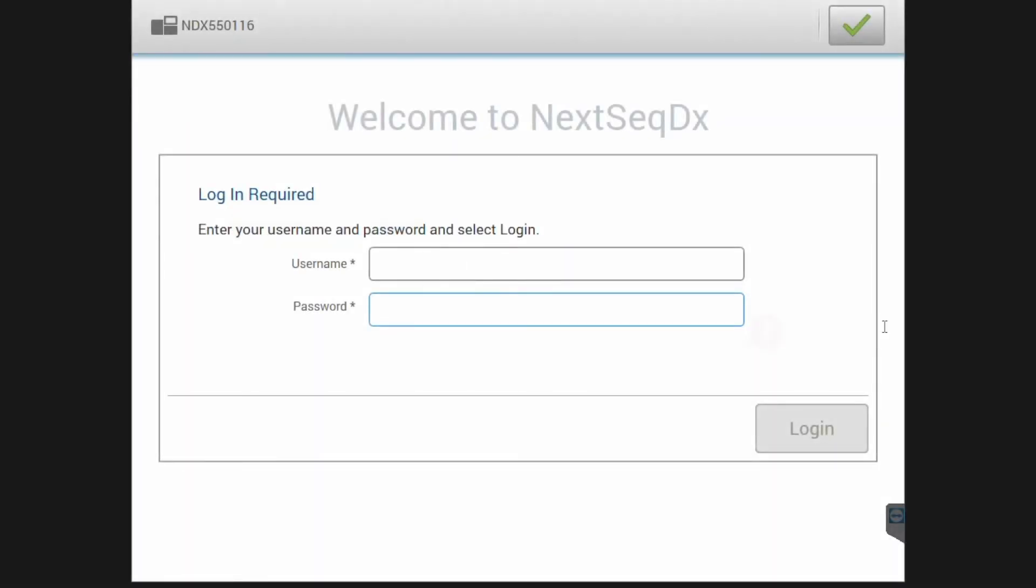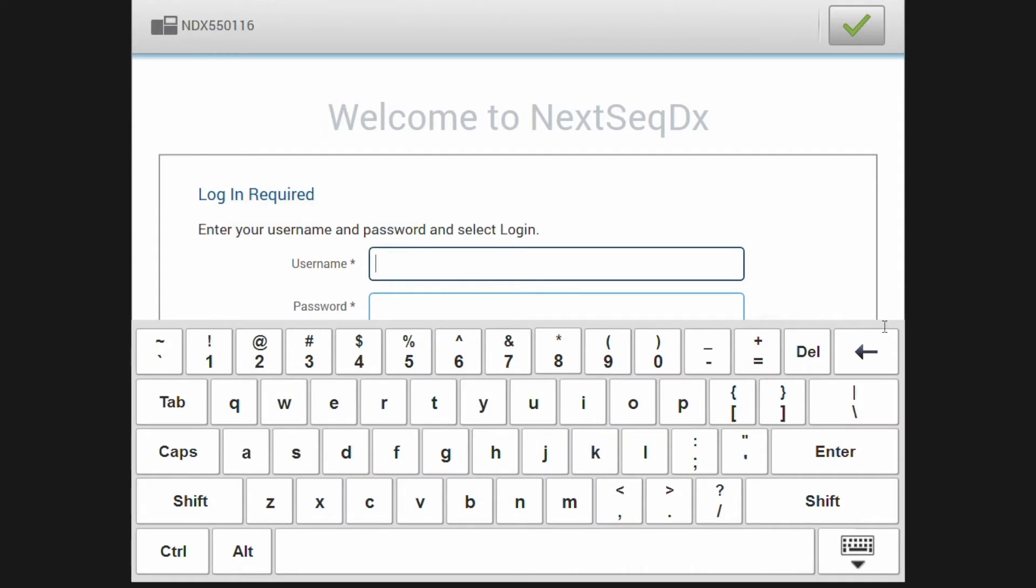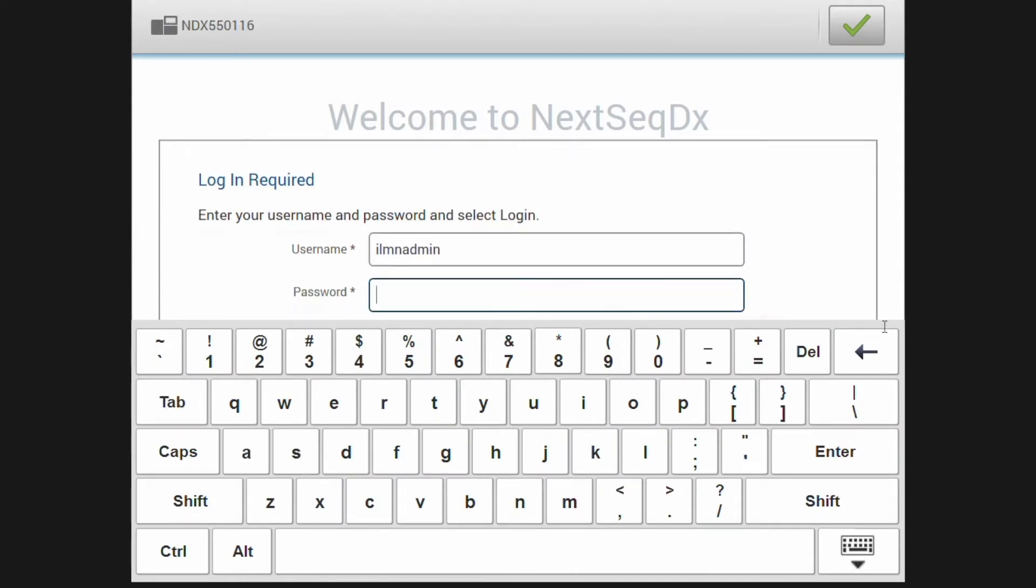NexSeq 500-550DX instruments initialize in the DX mode. When you wish to access the NexSeq in RUO mode, please follow the following steps.